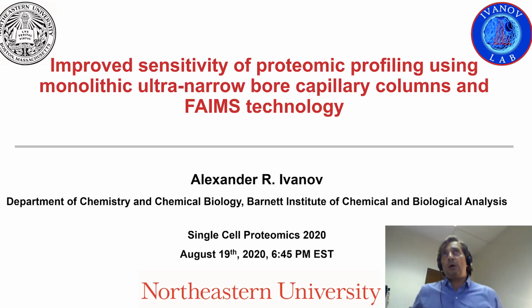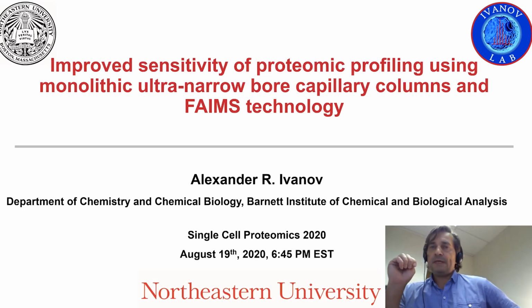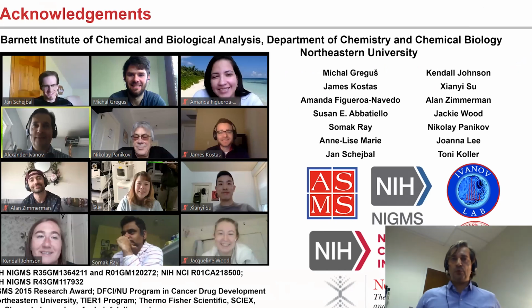So I was thinking about presenting several topics that we are actively working on in my lab: sample preparation, different modalities of separation coupled to mass spectrometry, LCC. But in the end, I decided to narrow down the subject of this presentation to coupling ultra-low flow rate separation, namely LC using monolithic columns, and coupling the separation to mass spectrometry using the FAIMS interface, which we got our hands on recently, about 6-7 months ago, and it was a nice toy to play with. So we decided to check whether the technology is compatible with ultra-low flow rate separations and analysis of limited samples.